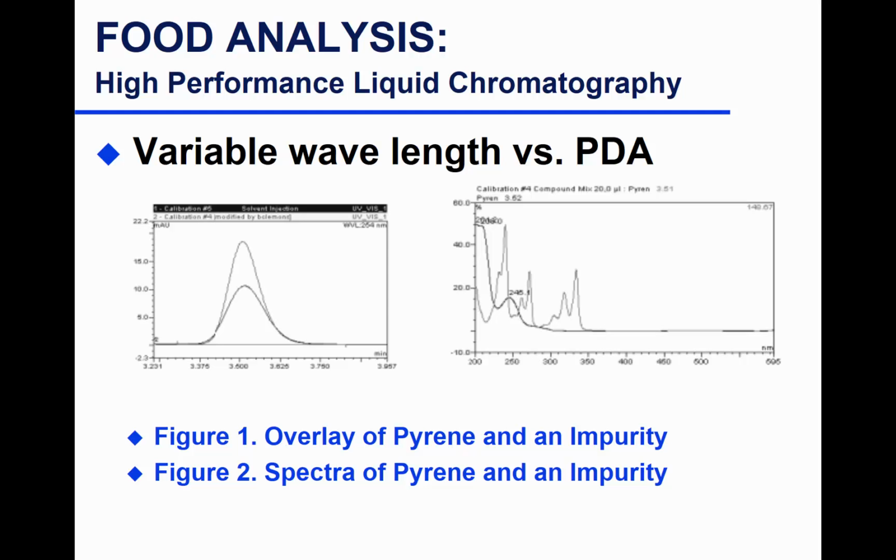Advantages of that, like we demonstrated in the lab, you can identify if a peak comes out at the same time as caffeine. For example, in a decaf coffee, when we saw one peak, at the beginning of it, it had a specific spectra. At the end of it, it has a different type of spectra. So it can tell you, like in this example, you have two different compounds present in that one peak. So the PDA can tell you that this peak is not pure. There's a co-elution occurring. Then you would know, okay, I need to do something to my method to allow for separation.